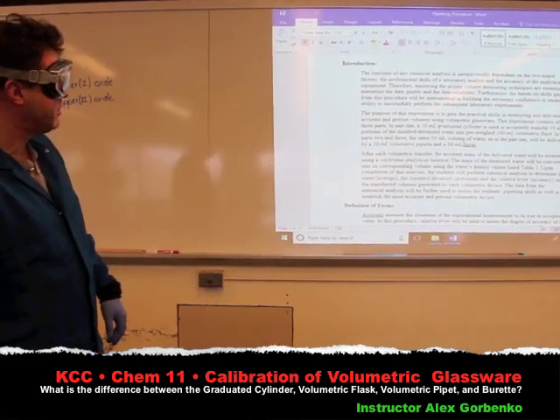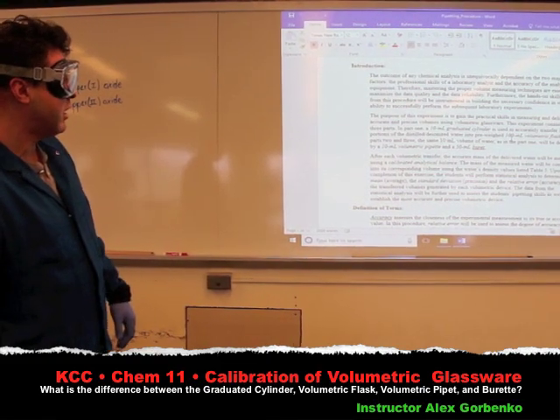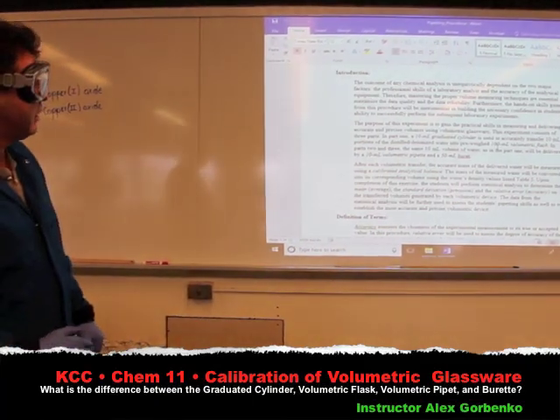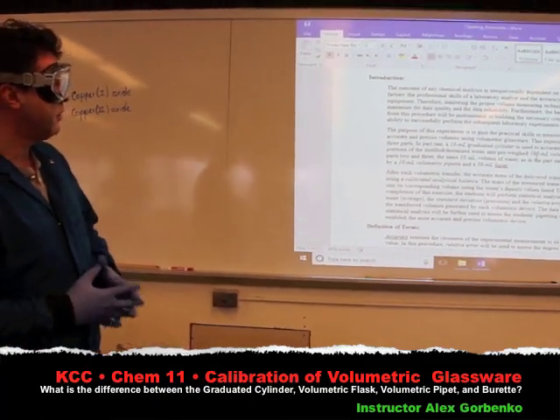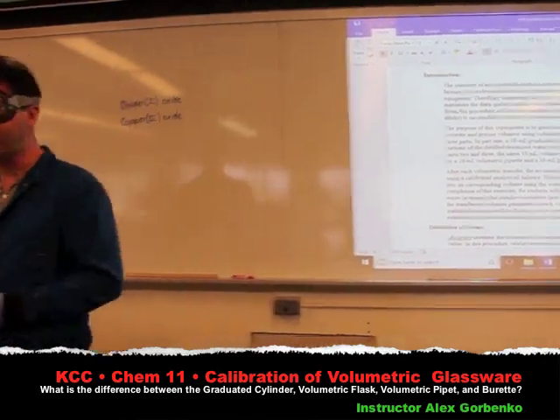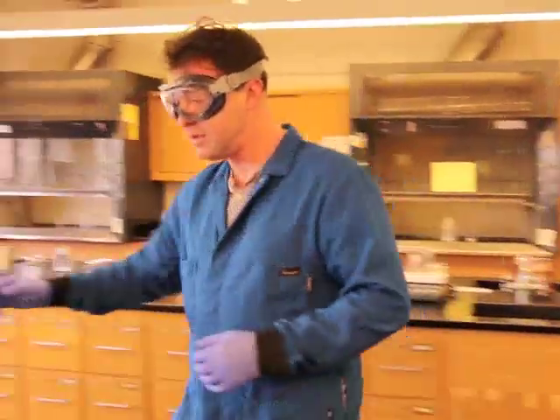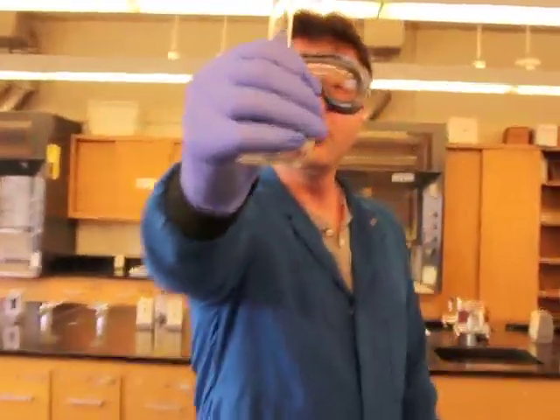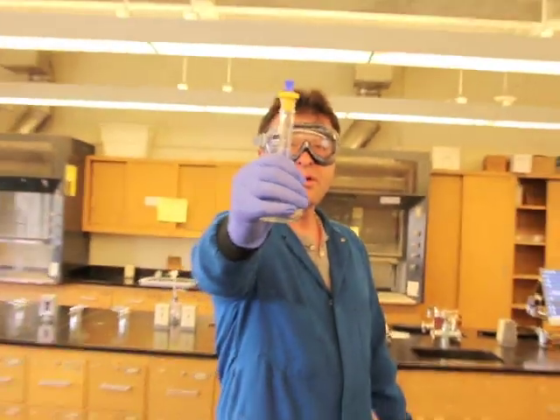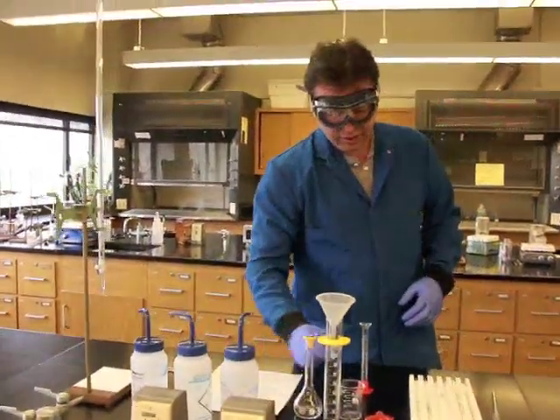Again, it's going to be just three pieces of equipment - this one is just to be used as a container. If we do a good job after 10 deliveries of 10 ml of each portion using a different volumetric glassware, we should get the bottom of the meniscus touching the line here on the volumetric flask, which will tell us that we got exactly 100.0 ml of water delivered.